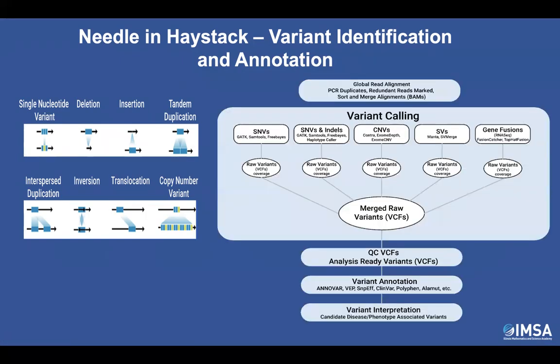So the onslaught of genome-wide data has led to the development of a battery of commercial or lab-developed tools for the identification of variants. However, very few variant callers are versatile enough to call all 3 types of genetic variants. So it's often beneficial to incorporate multiple independent tools in the clinical pipeline.